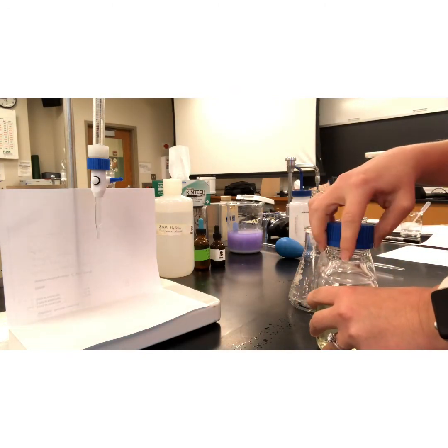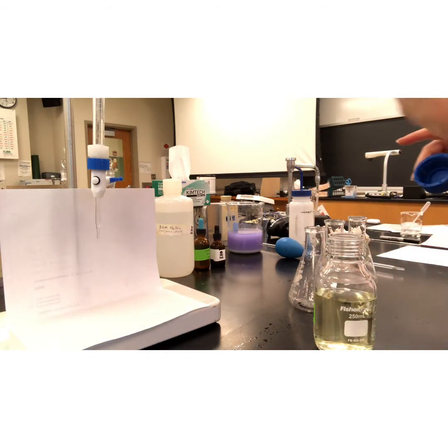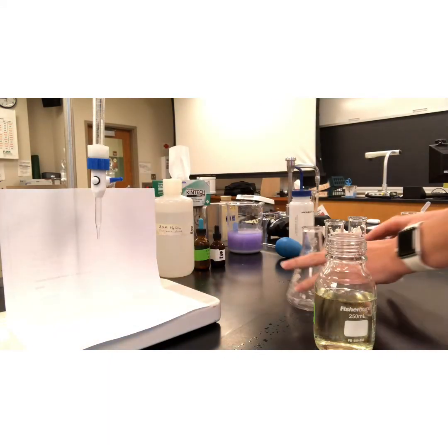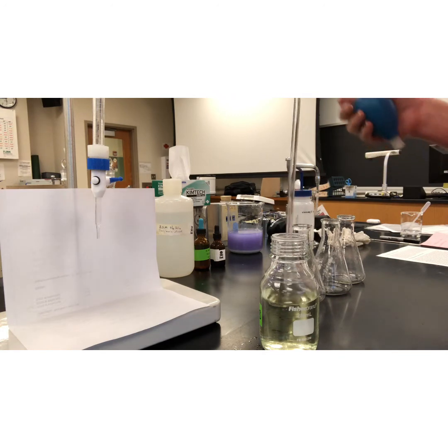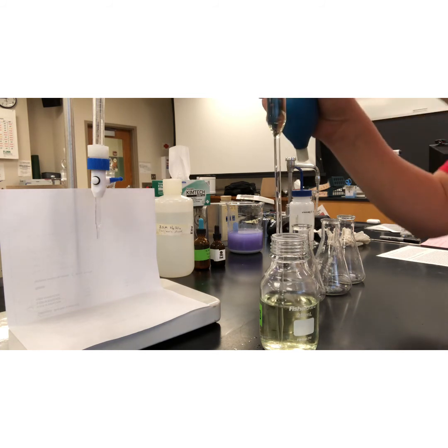From the sample jar. I am going to pipette directly from the sample jar, and only because I'm the only one using it. Don't have to share it with nobody else. It doesn't get touched again. I don't like doing dishes, so I don't want to do more glassware. How's that sound? It's a little lazy. It's okay. So I'm going to go ahead and do my pipetting procedure again. Use the bulb to suck this volume up into the pipette. Don't normally pipette directly from the sample container unless it's only yours. Then you can do what you want, contaminate it however you want. You mess up only yourself.